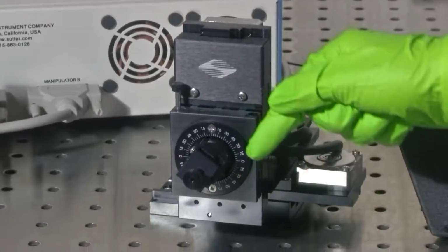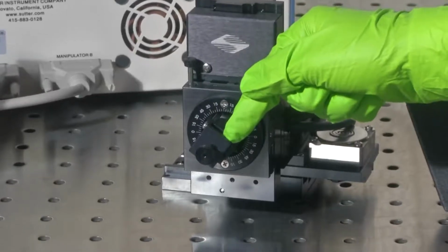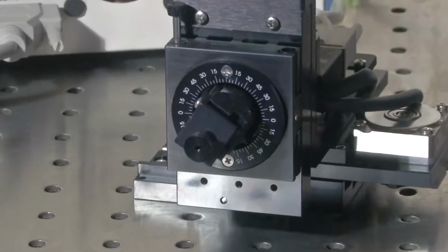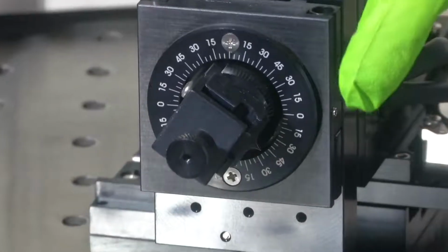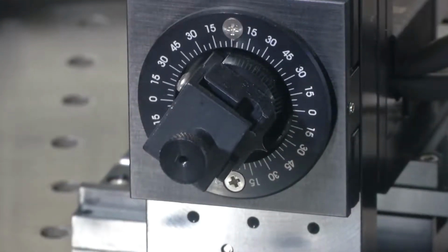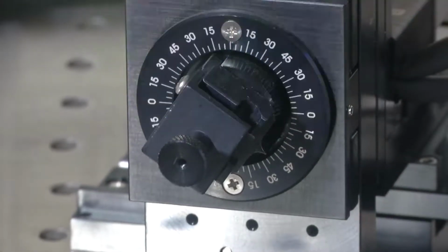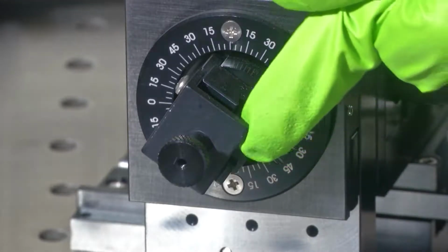The kind of tool, like I said, could be for single cell manipulation, or the purpose of research could be indentation in order to study the biomechanics. So, the indenter or any kind of tool would sit here.